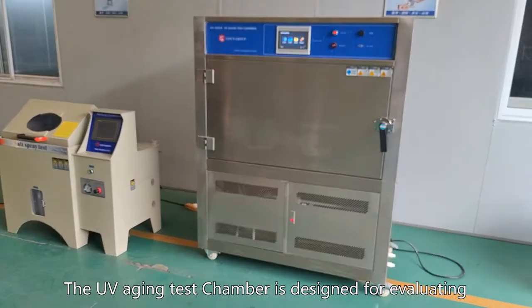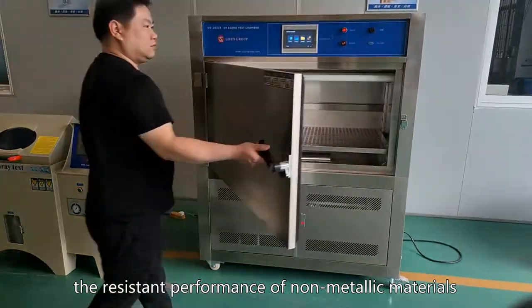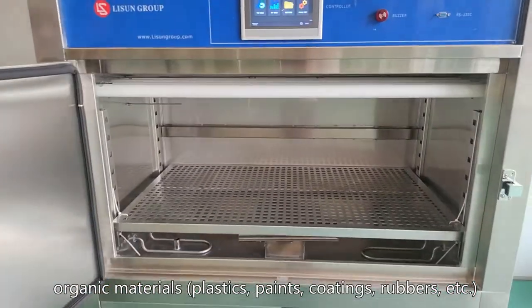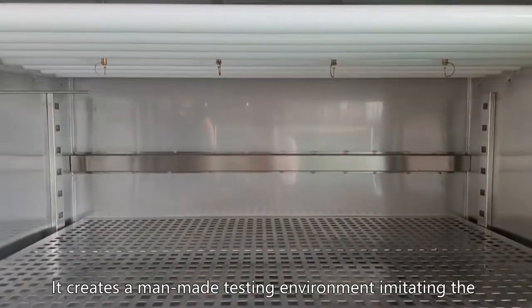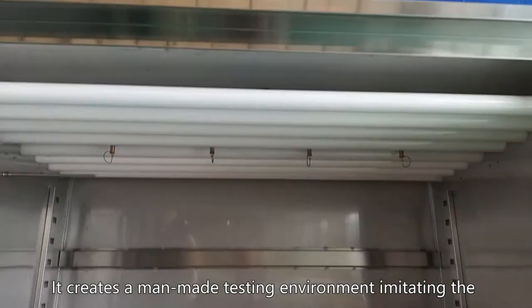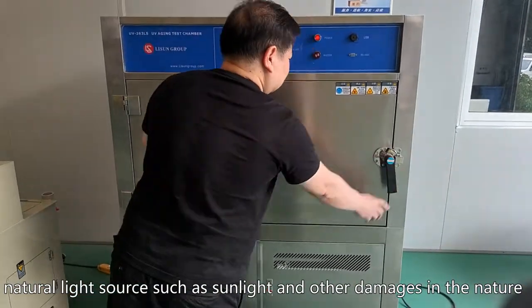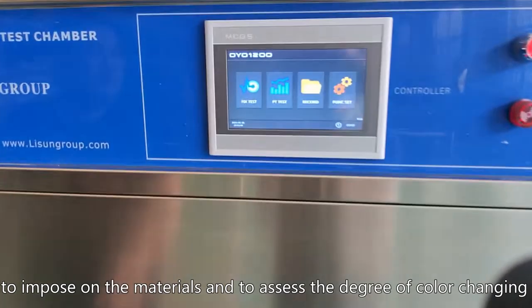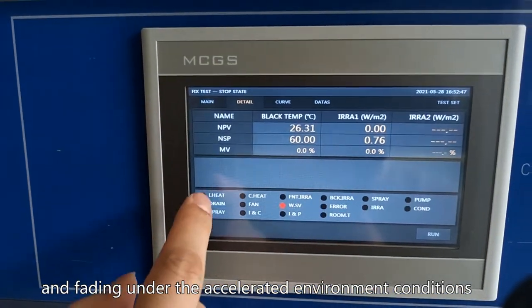The UV Aging Test Chamber is designed for evaluating the resistant performance of non-metallic materials and organic materials under specified conditions. It creates a man-made testing environment imitating natural light sources such as sunlight and other damages in nature, to impose on the materials and assess the degree of color changing and fading under accelerated environment conditions.